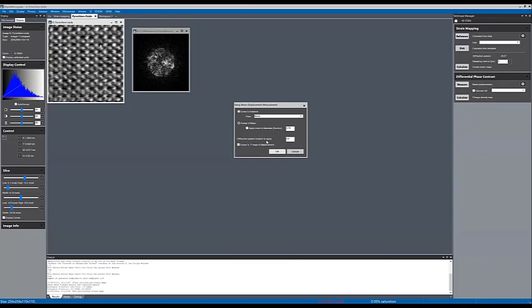And again, if you have measured your rotation, the diffraction rotation, you can apply that angle here. And that's, again, very, very important, as Roberto was saying in his presentation. You want to make sure to calculate in the correct directions. And here is what I was saying.